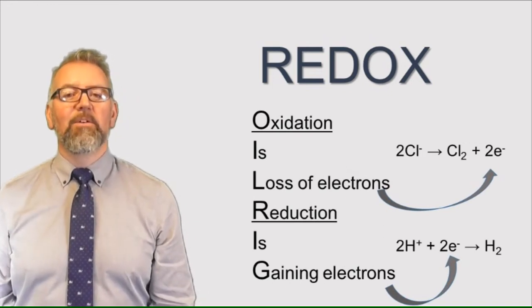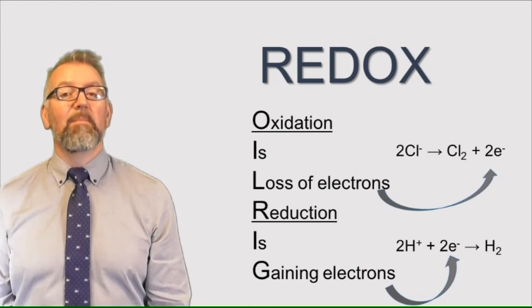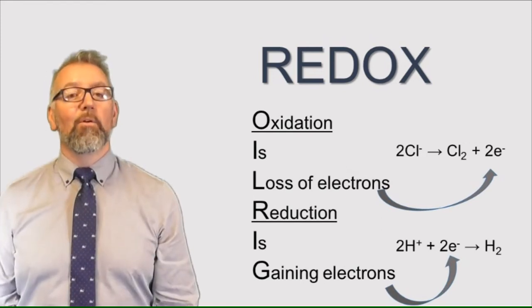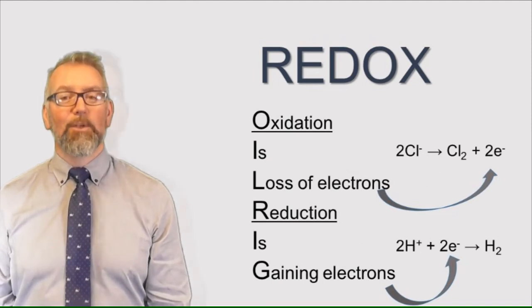At the positive electrode, the negative ions are oxidized. The ions lose electrons to become atoms. In the case of chlorine, 2 chlorine atoms join together to form chlorine gas, Cl2.